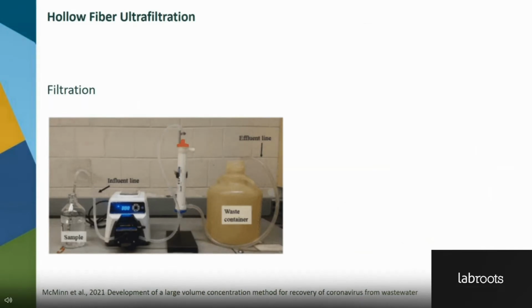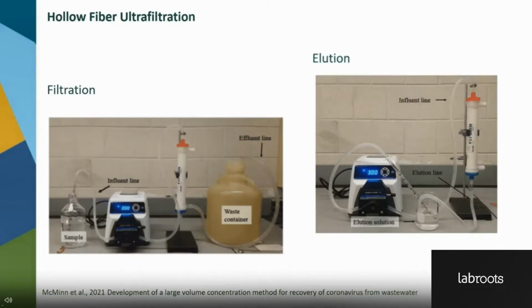For larger volume water samples, we use the hollow fiber ultrafiltration approach, which is also known as the HFUF method, because this filter column here has a larger surface area. In our lab, we process 20 liters of the secondary effluent through the hollow fiber filter using a peristaltic pump, and then we elute the filter with the elution buffer using the backwash approach. The elution buffer contains phosphate and Tween-20.